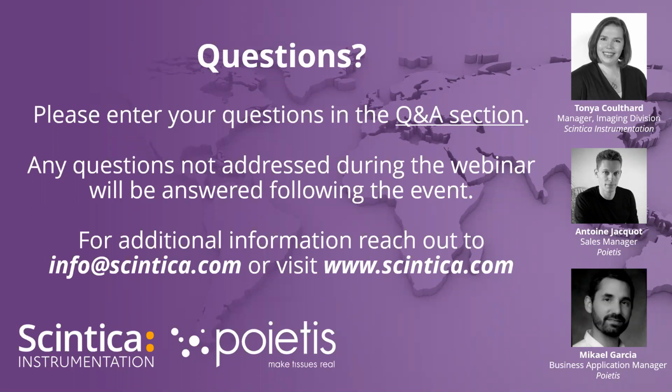Perfect. Perhaps for Michael, do you have a database of printing templates that people can choose from for different types of applications? That's a really good question, and it's also something that we've got in mind to create a library. So actually what we propose is to help the customers regarding the parameters that they will require for each kind of cells, each kind of material. We can provide some data sheets about that. But yes, it's something that we want to do, a real library inside provided with the machine. But actually what we provide is this kind of services to help regarding the kind of cells you use and regarding the materials.